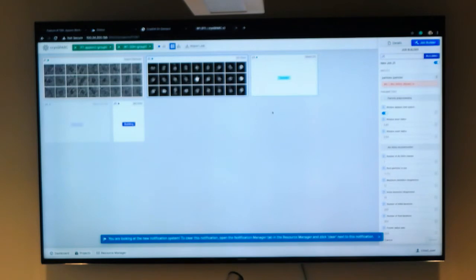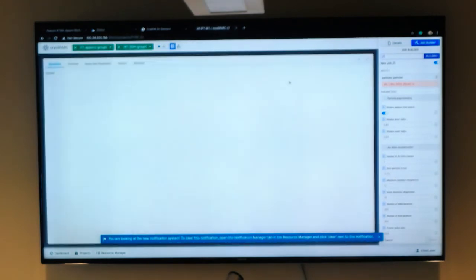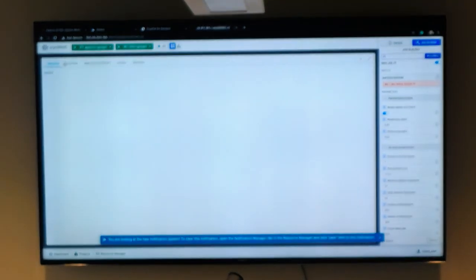But the idea is that a lot of the interface is point and click, and you can always feed forward certain inputs that haven't even been generated yet to queue up jobs.